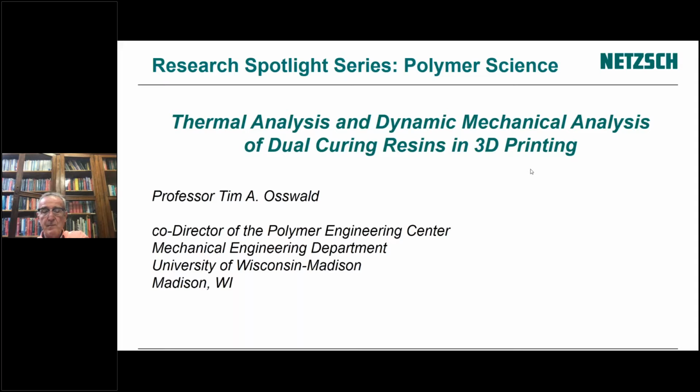Thank you. The next question says, why was the coefficient of thermal expansion of the printed materials not evaluated? Oh, why wasn't? Yeah, good question. We do have a system that measures a PVT curing reaction where the volumetric shrinkage can be evaluated. Yeah, I think it's just a matter of, there are some things that I'm not sure why Alec didn't. Maybe he's in trouble now that he didn't do that analysis.